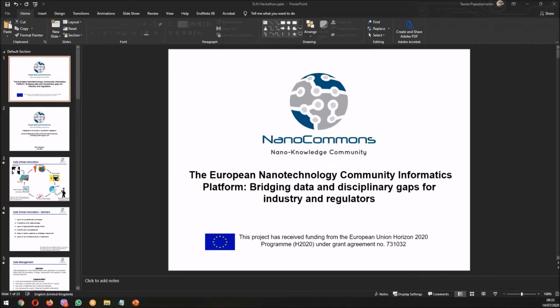So as Martin already has said, the idea of this webinar is to go through the basics and an introduction on electronic laboratory notebooks and how they can be used in nanosafety research for actually capturing your data and your metadata as they are being produced.